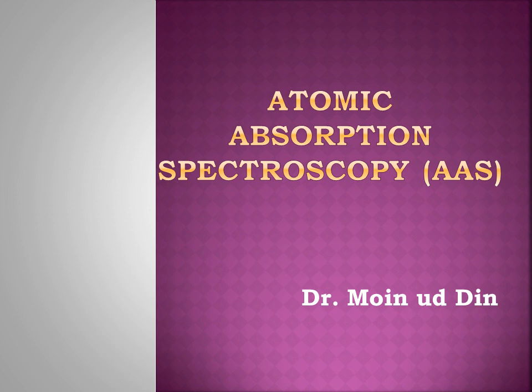Hello dear students, I'm Dr. Moin. In this video we are going to discuss atomic absorption spectroscopy, which is also known as AAS.